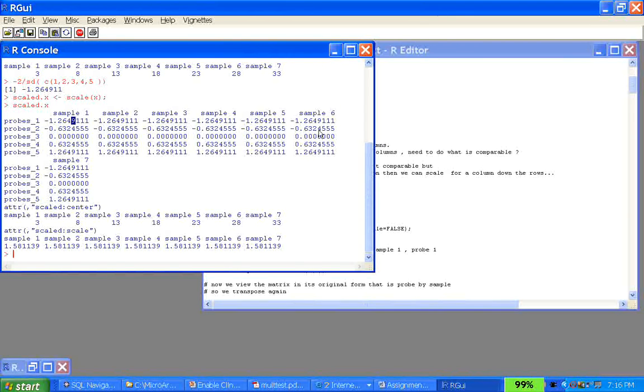If you use normally distributed data with some highs and some lows and something in the middle, you're not going to get that, and we'll see that later. But just assume they're different. So you want to actually compare or scale values for the same probe sets across the samples. Because if you go this way, then you're jumping from one probe to the next probe, and that doesn't make sense. You want to do it for the single probe's value across the samples.